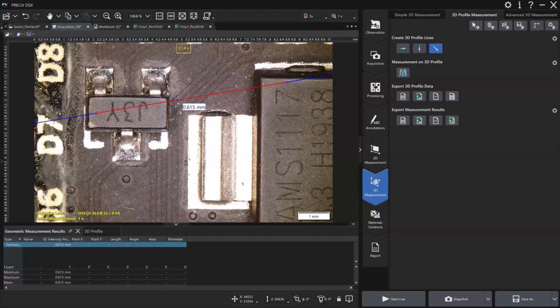Yeah. This next one, I think, has to do with the measurement volume, and I'm going to assume of the microscope. Nesta wants to know, I need to measure a piece 1.5 inches by 2.25 inches by 0.25 thickness. What's the range of this device?